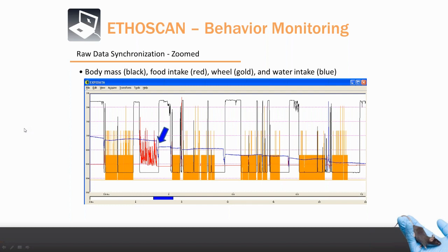Takes a huge drink of water after eating, gets back into the habitat, gets restless, takes another drink of water, a small one, on the running wheel. Back in the habitat, running wheel, habitat, running wheel. Now it does nothing. So this is a short roam or a short lounge, where it is basically just wandering around the cage and not interacting with any of the sensors.